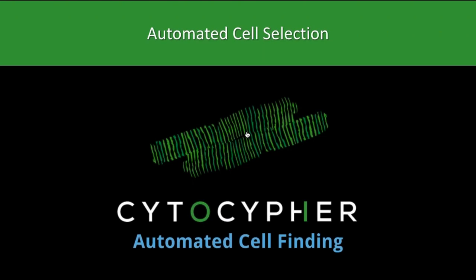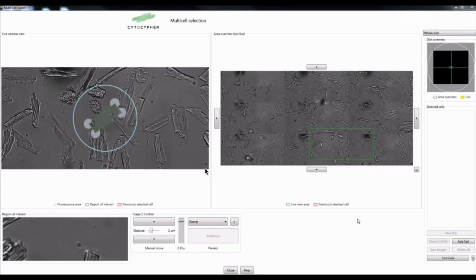As you saw in the manual mode, you're doing the same thing again and again. You click on a cell, you judge whether it's good, you may adjust the autofocus, then you rotate it a little bit and you check whether the signal is good. All these steps can be automated. So that's what you will see here.